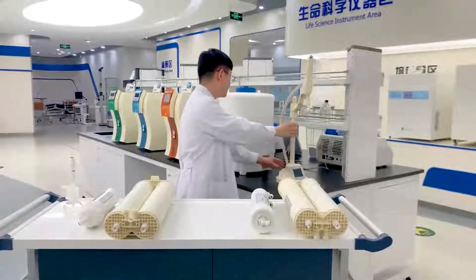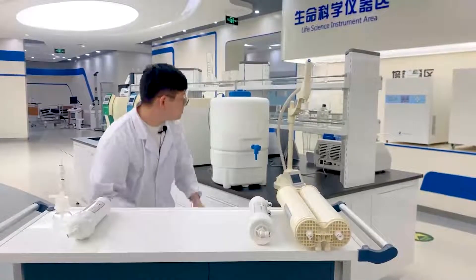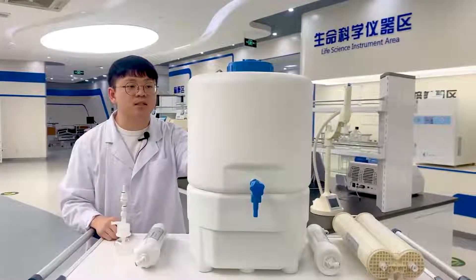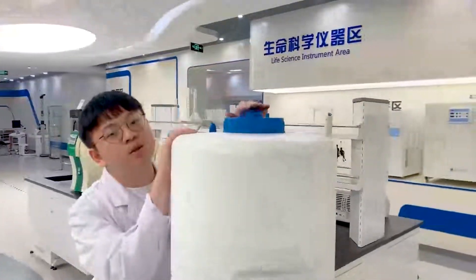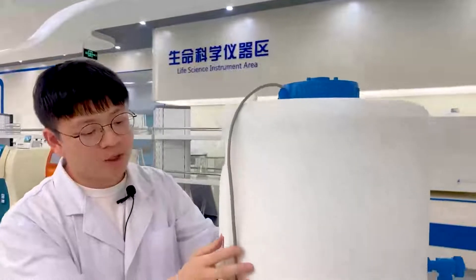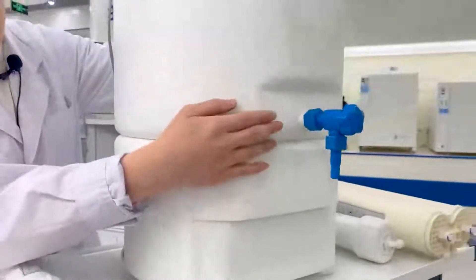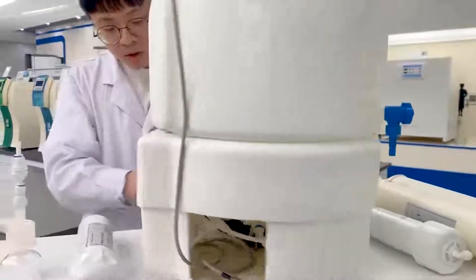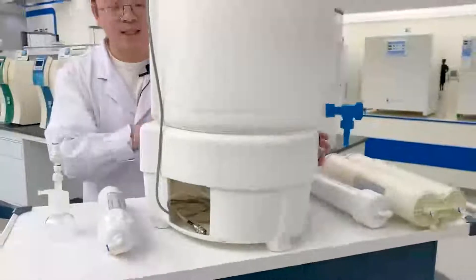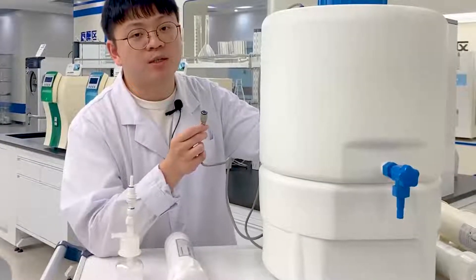This is our water tank. We have a 30-liter and a 60-liter water tank. We have a UV lamp, an air filter, and a pump so you can draw water directly from the tank. There are also import, output, and recycle ports. Importantly, this tank connects to our main unit so you can monitor the water level.